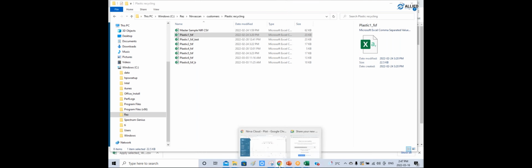and then you can upload all of these at once. So you go here, when you want to make your LDA model, you say add LDA model, and then you would say, for example, webinar, you give it a name, webinar March 16, a number of components too, and then you would choose all those plastics. 5, 4, 2, 1, and so on.